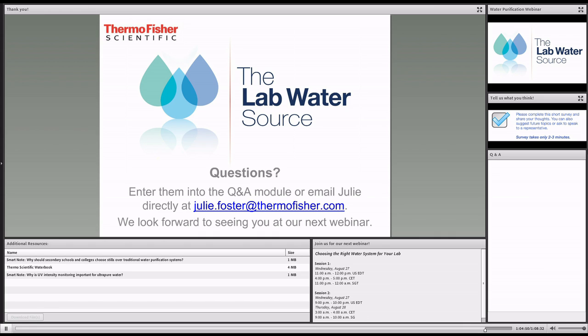We'll take a couple more. When is it best to use an EDI system? We tend to quote EDI systems for customers who need a large amount of water, probably because our EDI cell is in one of our water systems that produces a lot of water. So the only time really not to use an EDI system would be if you had trouble with your feed water, if the quality was inconsistent, or if you had a lot of hard water, then I wouldn't suggest it. Or you definitely would need a softener in front of it.